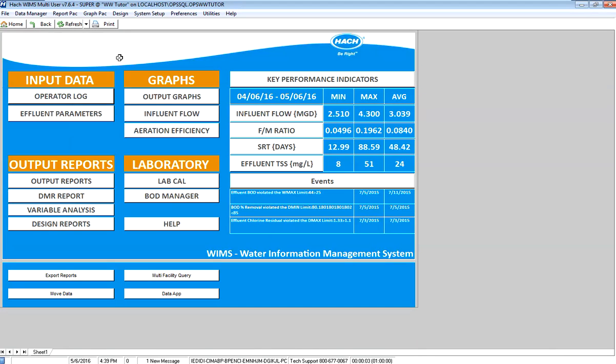In this video, I'll be covering advanced design of monthly data entry forms, changing colors, and getting it to look better than the default view.